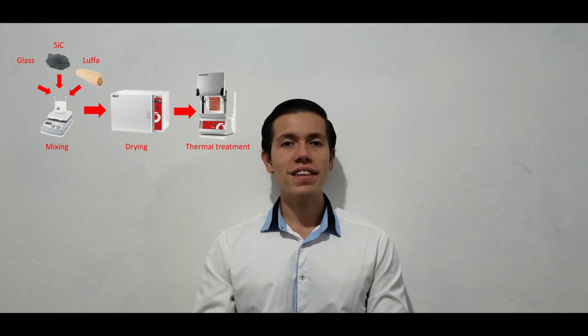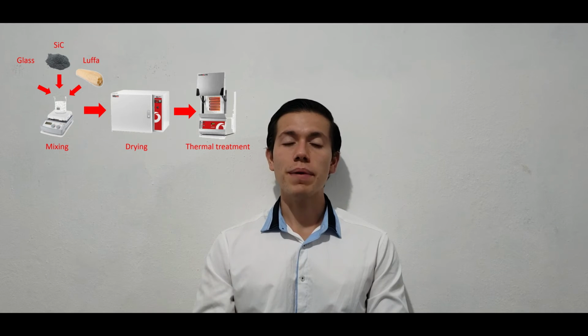In order to produce the samples, we first mix all the components with water in a magnetic stirrer. After that, we dry the powders in a convection oven. And lastly, we thermally treat the samples in a sintering oven at a temperature of 775 Celsius degrees, with different holding times. The capillary tests were performed with water as the liquid medium.